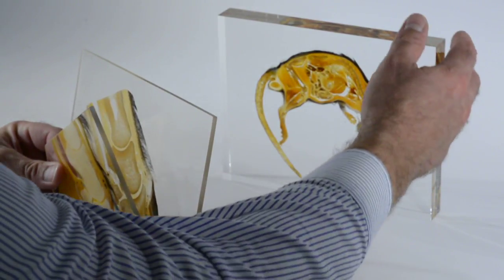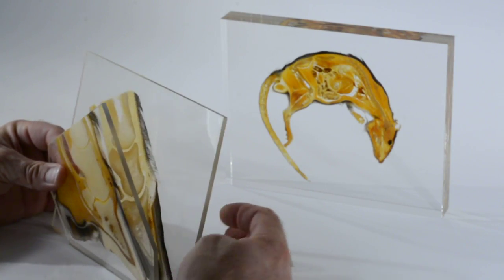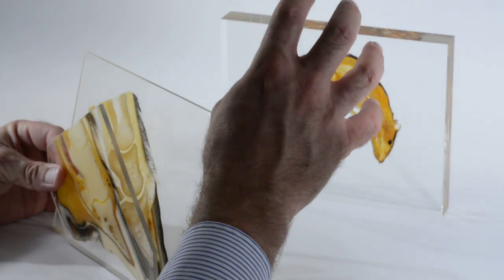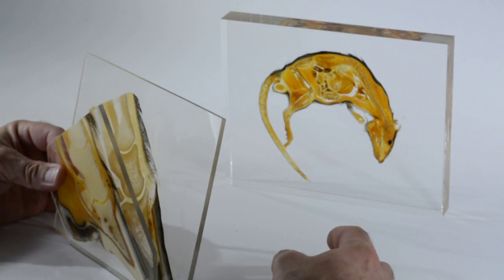The acrylic can be polished, it can be even removed and replaced. So whatever happens, the specimen inside is safe for literally hundreds of years.